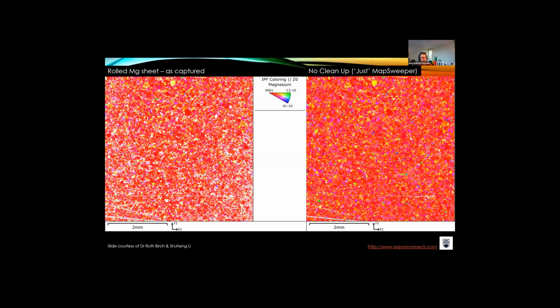Yeah, so charging typically happens because the electron dose isn't being sent to ground. So the most important thing will be how have you welded the sample or stuck the sample together, and how is the sample holder set up? We have some issues. We don't quite like our holders, and we're redesigning some new ones to reduce charging. So the other piece is sample cleanliness. These are all thin foils, and the SEM doesn't really like small samples. The whole thing's set up to have a bigger thermal mass and a bigger surface area. And so those sort of issues.